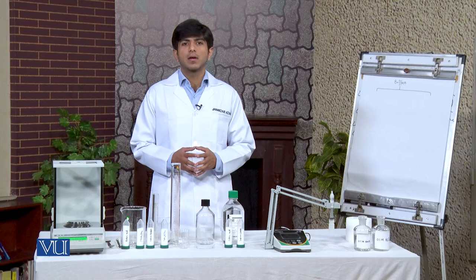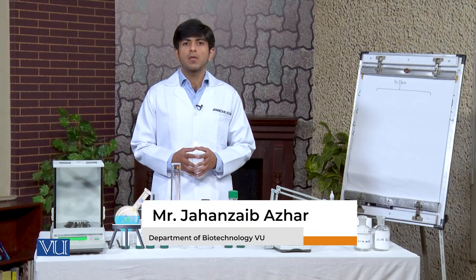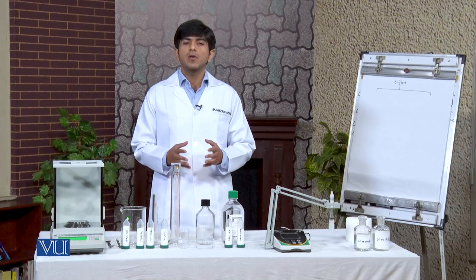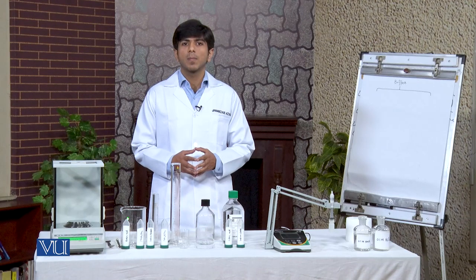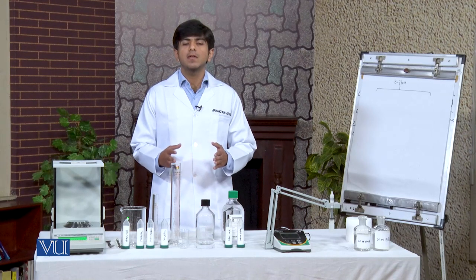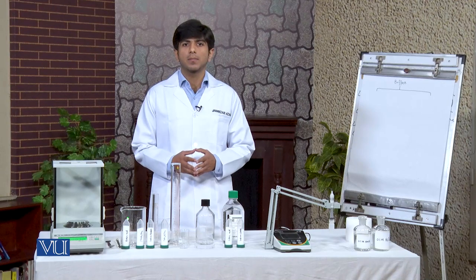Dear students, today we will learn about preparation of buffer. A buffer is a solution that can resist the change in pH upon the addition of an acidic or basic component. Buffers are usually able to neutralize the amount of acid or base when added to the solution. Thus, it stabilizes the pH of the solution.